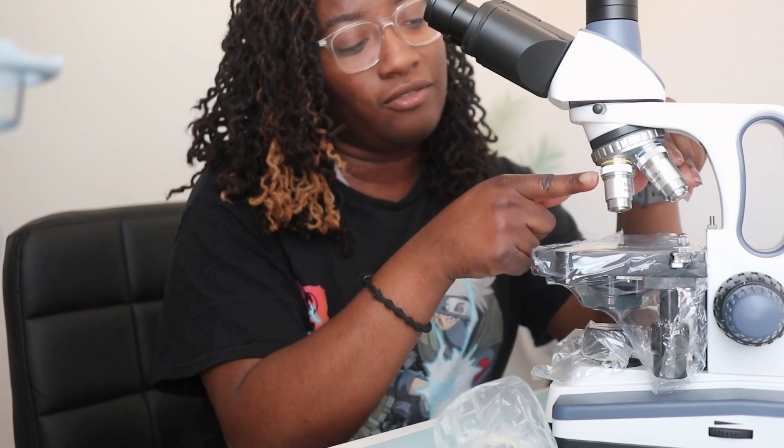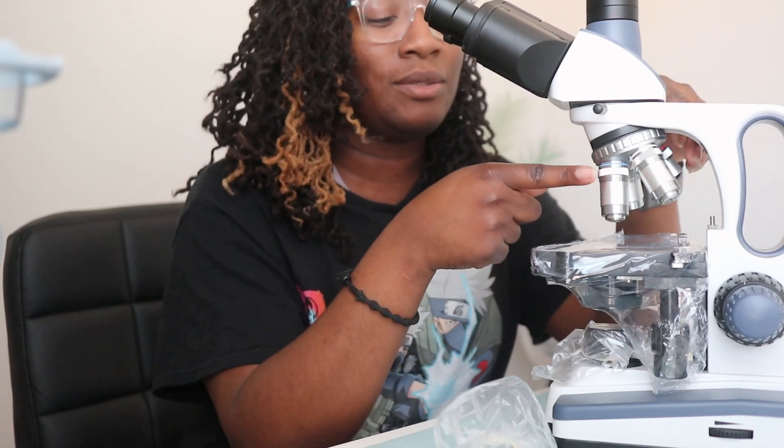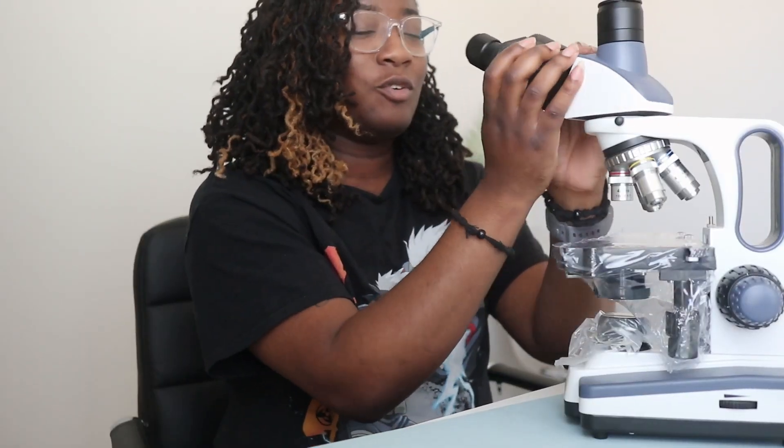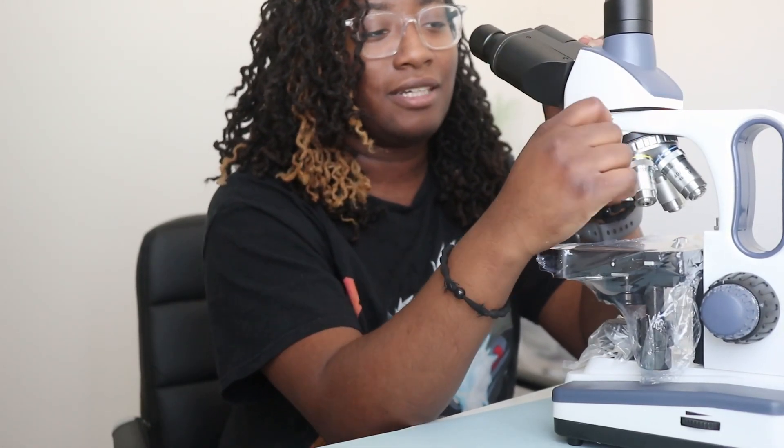The objectives are the 4x, 10x, 40x, and 100x. I honestly would have preferred to have 10x, 40x, 50x, and 100x. One thing that's already annoying me is this head — I don't know why it's set up like that. I haven't seen how I can adjust it, but it's too loose for me and makes a really loud noise. I don't like that.